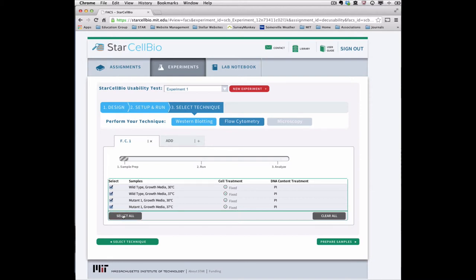In this experiment, we will analyze the amount of DNA content using a fluorescent dye called propidium iodide, or PI. Using this technique, we will analyze the amount of DNA in each cell within the collection of cells in the sample.